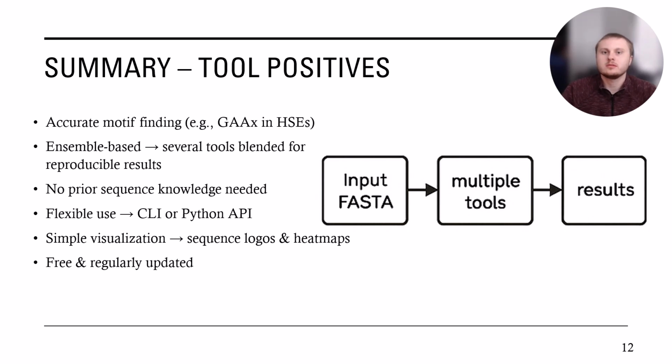Looking at the GimmeMotifs tool, we have also deduced, as it's been proven by a lot of other research projects and publications, that the tool is very fast, robust, and very accurate at analyzing everything from tissues to conserved DNA motifs, which is what we did in this project.